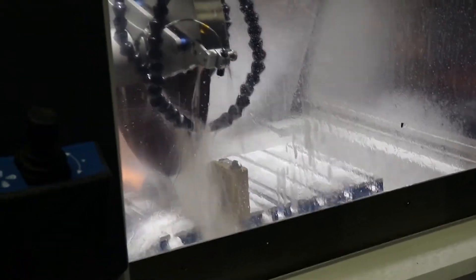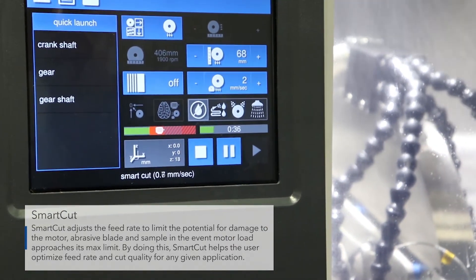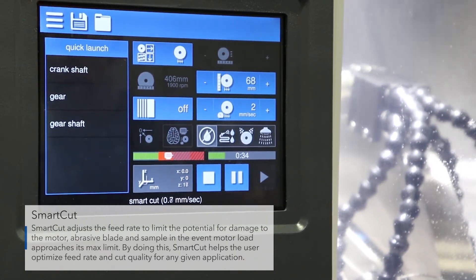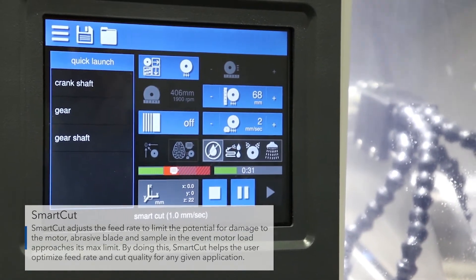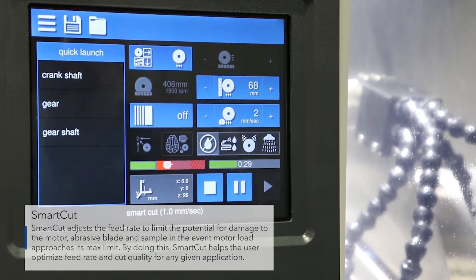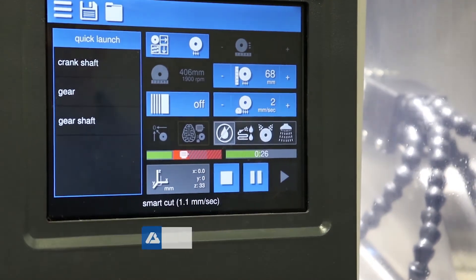The sample is being cut — you can see Smart Cut is activated, reducing the feed rate at the initial stages of the cut and allowing the feed rate to accelerate as the cut proceeds. This allows you to get the fastest cut time while still ensuring burn-free cutting, and takes the guesswork out of setting the feed rate for parts of varying geometry or parts of unknown hardness.